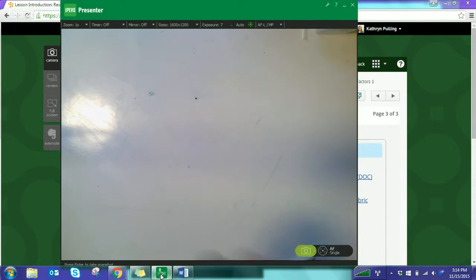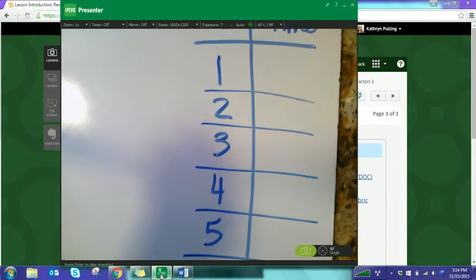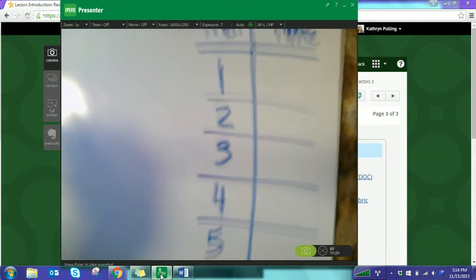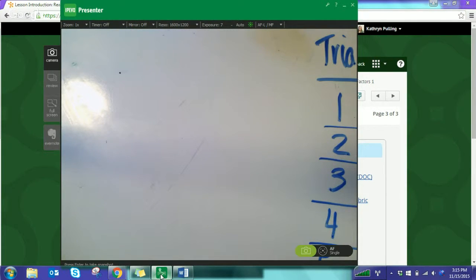You can, in the lab report, set this up, or I just have it, I'm working on a whiteboard here, but on a separate piece of paper, some sort of table so that you know trial or mixture, okay? There's 7 that we're going to do, and you need to record times. There is a stopwatch in your kit, or you can use a cell phone if you have it handy, and that's what I have handy. So I've got my handy dandy cell phone here.